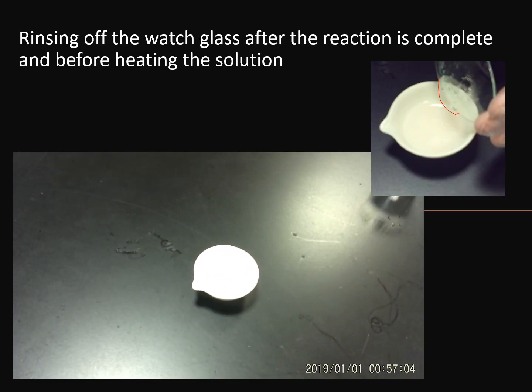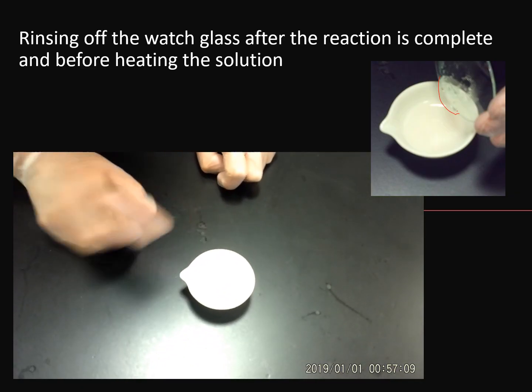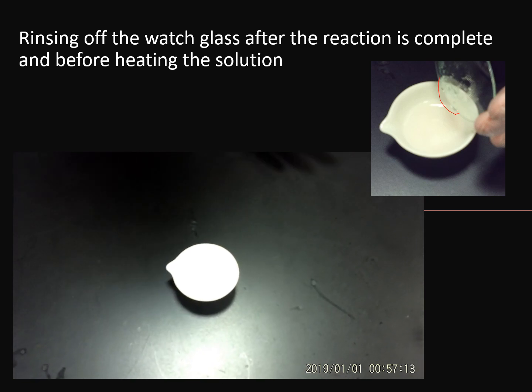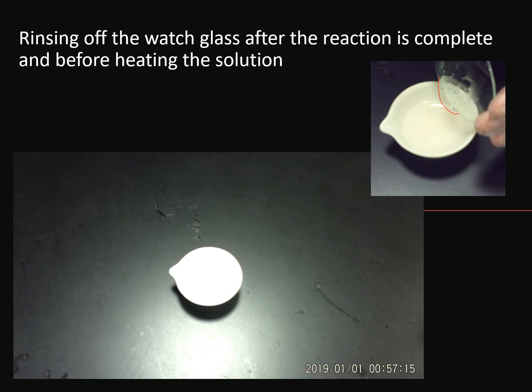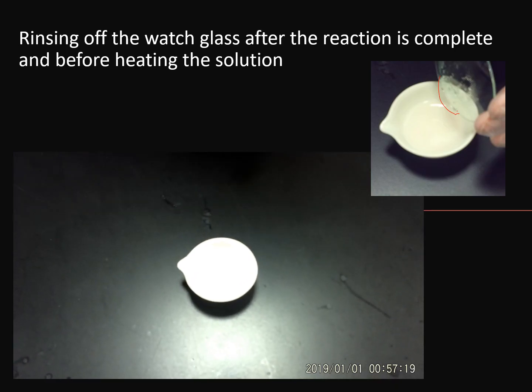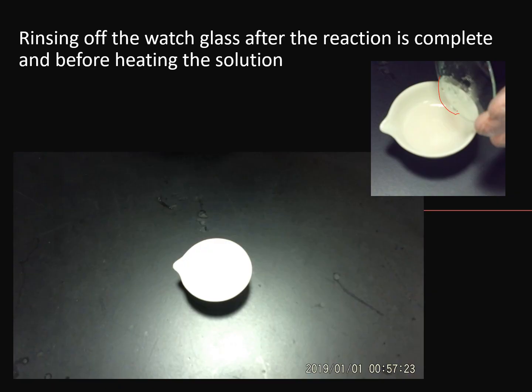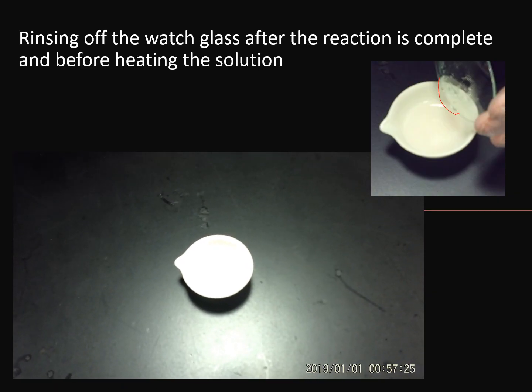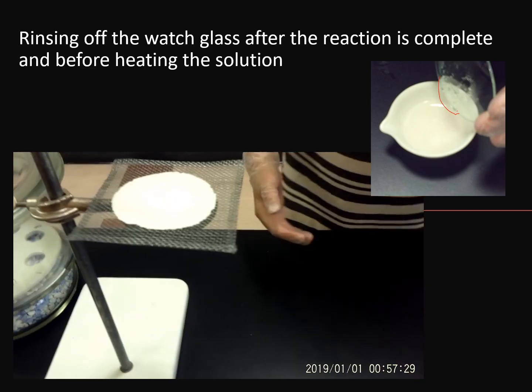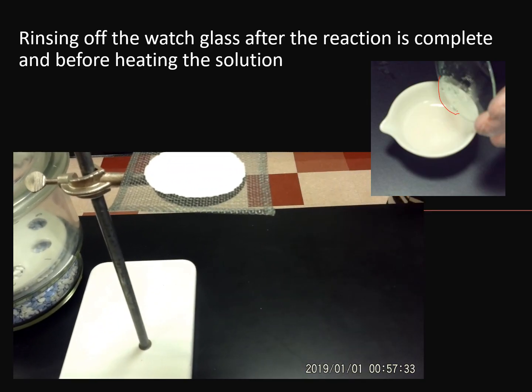Now, we're ready to do the next step. When you evaporate the water, you will not have the watch glass on it. You're going to just go like that. And let me go ahead and show you how to determine the height. Because once you finish evaporating the water, you're going to put your crucible directly on here, and you don't want it at the inside blue flame of your Bunsen burner. You want to do more of a gentle heating. So we'll try to keep this on the higher side.